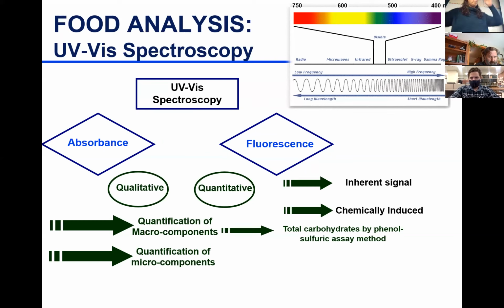Quantification of microcomponents, for example, we just did atomic absorption, that is quantification of microcomponents, which are your minerals. Also, you can do vitamins, for example, when you cover the vitamin chapters, we can talk about thiamine, which is measured using a fluorometric method.